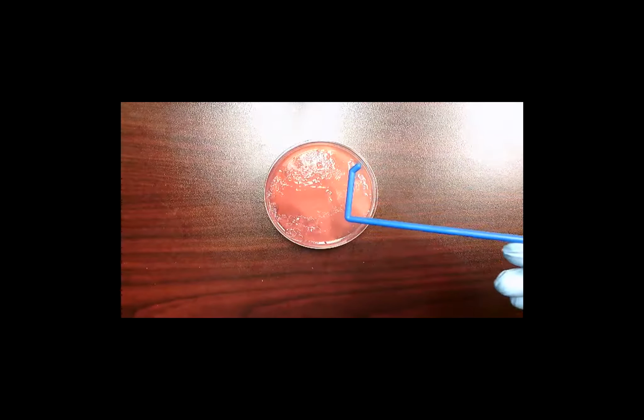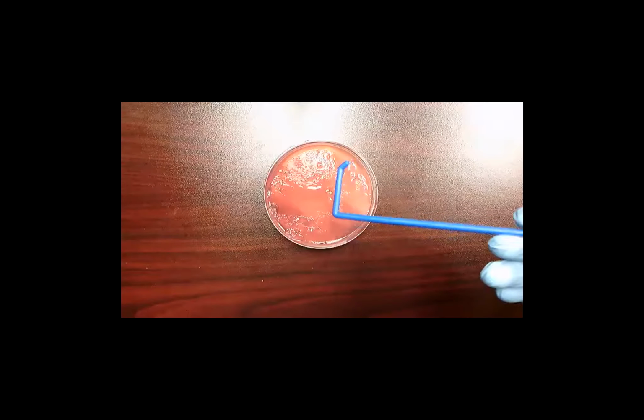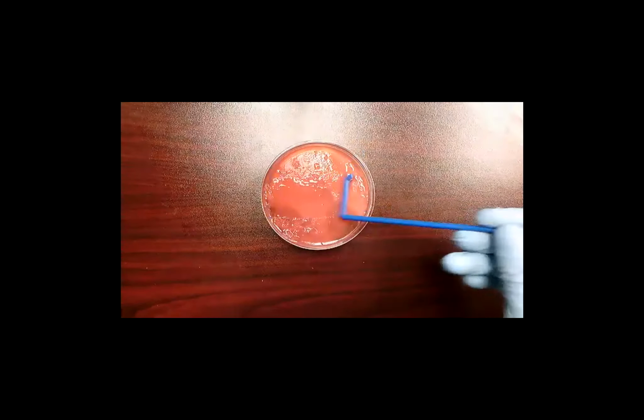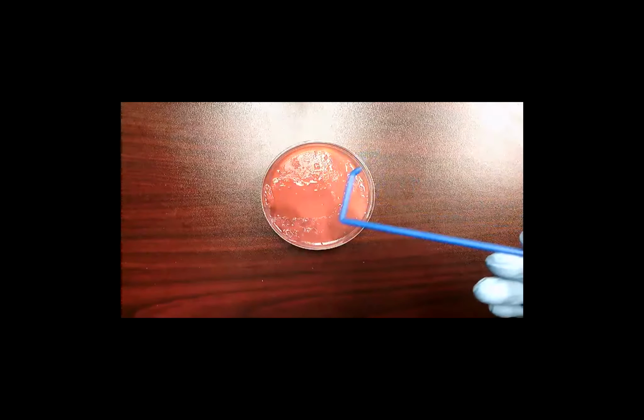So if any of your science departments or you have them in your classroom, I would highly suggest that. It helps make it even. Or you could probably make something fairly easy that you could spin the plate on and then spread. What questions do you have about plating the water on the agar?